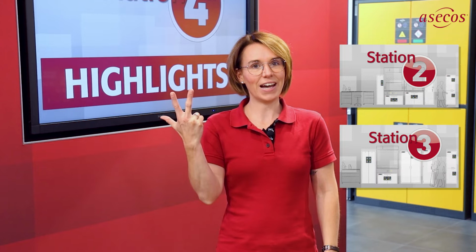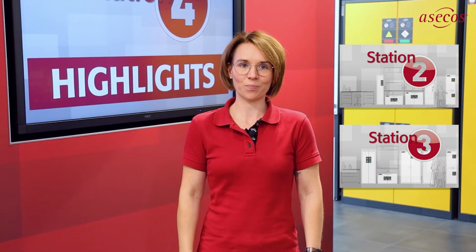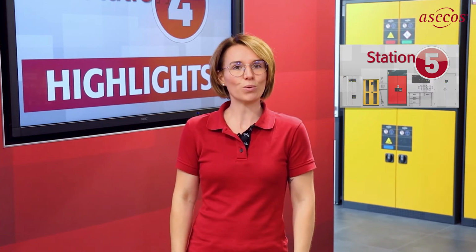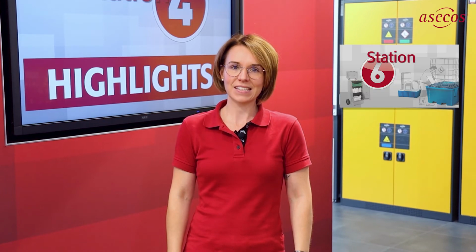Station 2 and 3 show products that are mainly used in the laboratory. We present our highlight products at Station 4. Station 5 shows and explains typical products for industrial applications. At Station 6, we show an insight into the asecos product handling range.